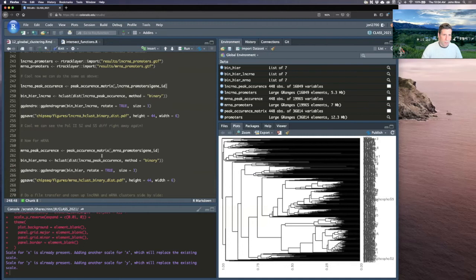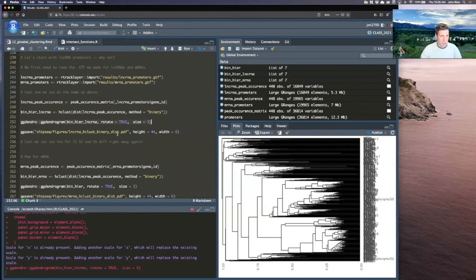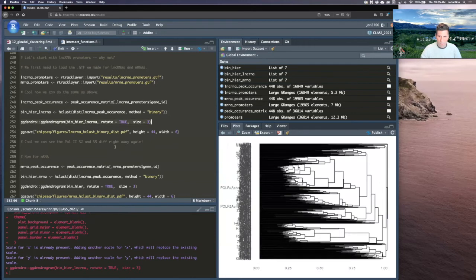But sometimes it looks weird to see this empty thing and a comma, and that's just saying keep the rows and then reduce these columns by this filter. Keep these rows and reduce these by this. Okay, so let's go ahead and run this. And I believe I already have that. Yes, that might take a minute. Same for this. Run that, and then we'll plot it here. And let's see what that looks like. Shouldn't take too long. There it goes.